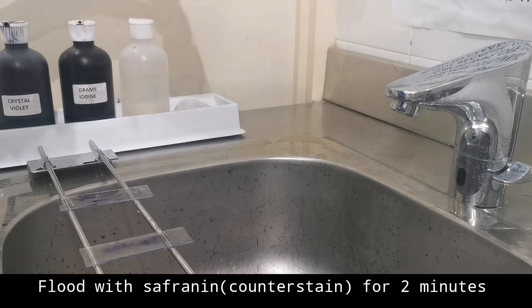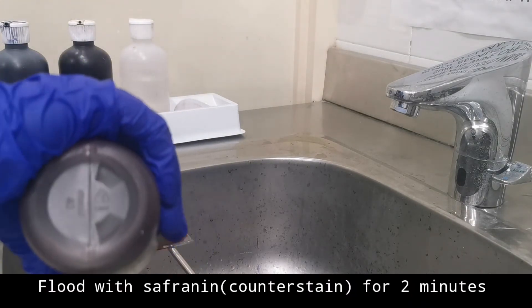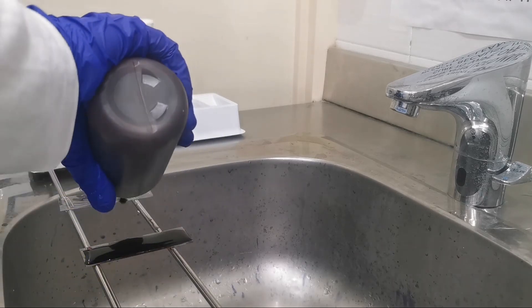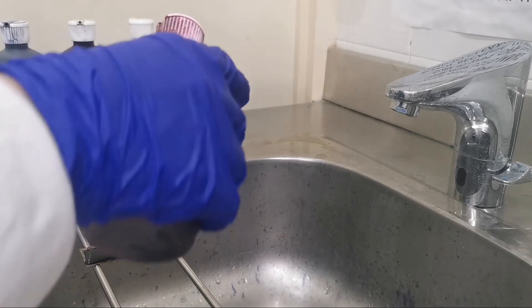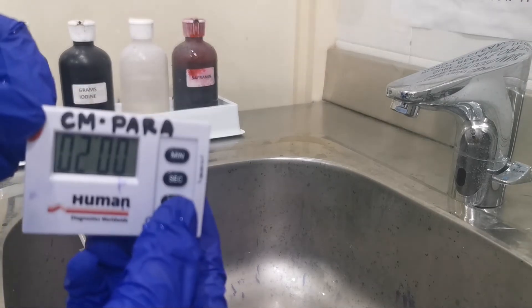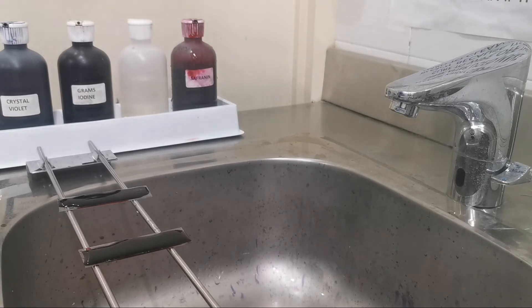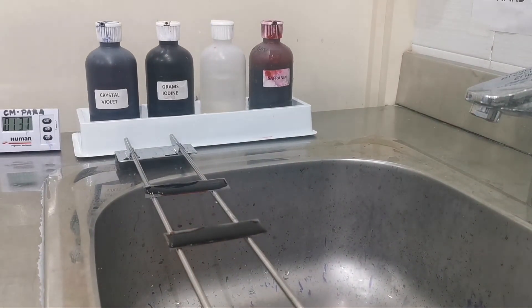Now we will flood the slide with our safranine stain for two minutes. This safranine stain will stain our gram-negative bacteria. Because the crystal violet-iodine complex leaked out of the cell when we added the decolorizer, the cells can now subsequently be stained with our safranine counterstain.